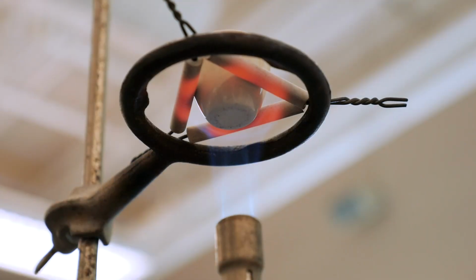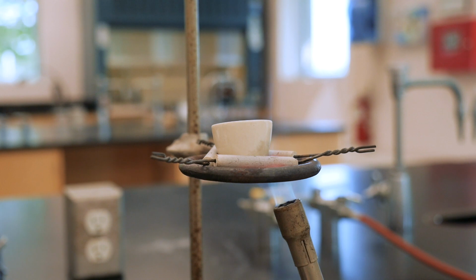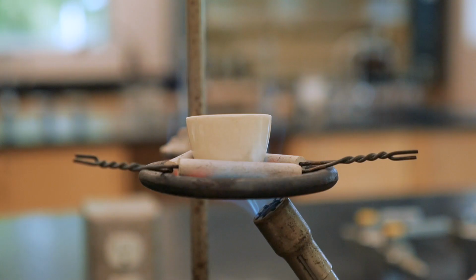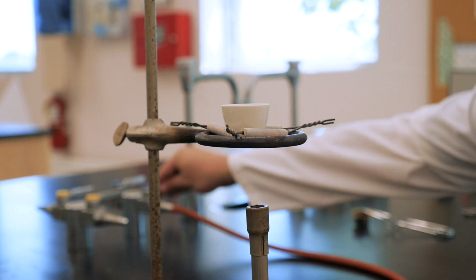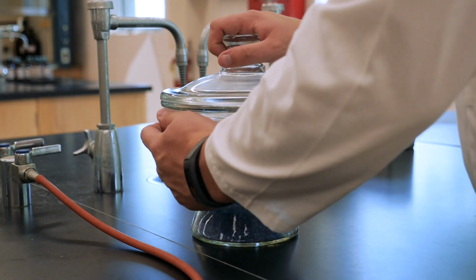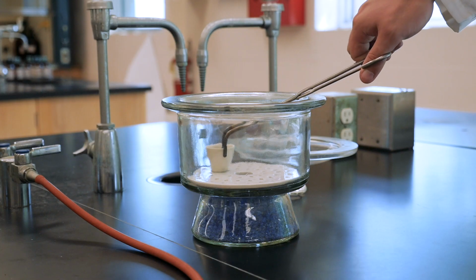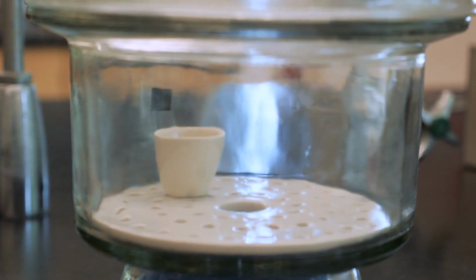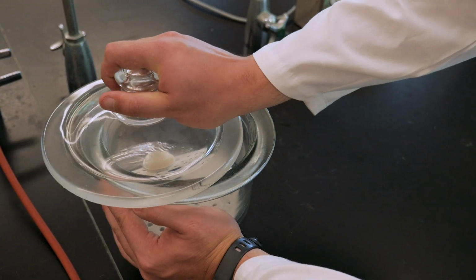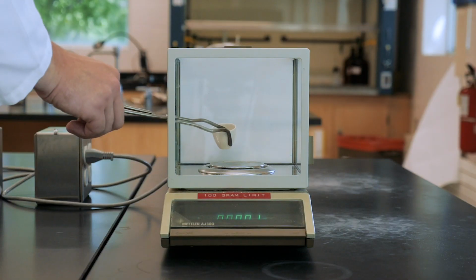As you're heating, sometimes you can see a black deposit forming on the crucible. This is carbon from the flame, and it can throw off your mass measurements later, so it needs to be removed. You can use the direct force of the flame to burn it off. Once you're done, allow the crucible to cool in air for 3 minutes, and then use the tongs to transfer your crucible to the desiccator. This desiccator provides an anhydrous environment for the crucible and other objects to cool, without having to be exposed to any water molecules in the air. After your crucible is cooled for 10 minutes, determine the precise mass of the dried crucible using the analytical balance.